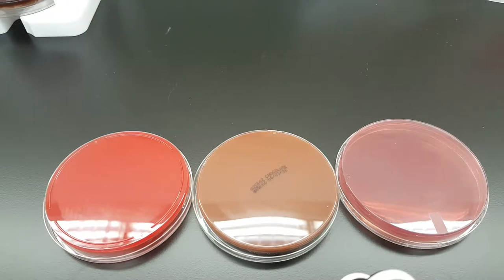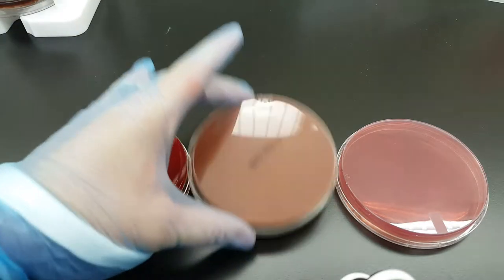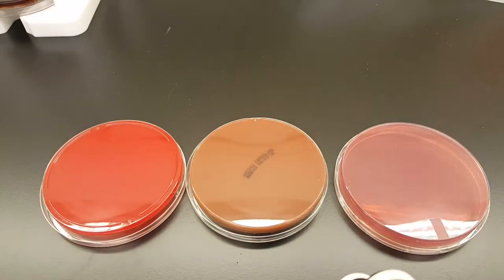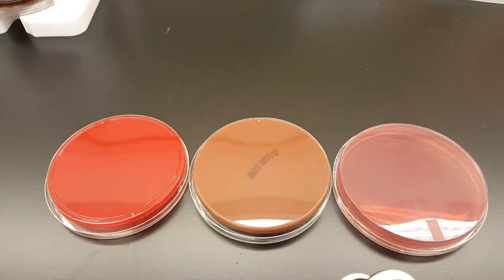Hey everyone, today we're going to talk about labeling and inoculating microbiology plates. This is a blood agar plate, this is a chocolate agar plate, and this is a MacConkey agar plate. I have taken them out of the refrigerator — they have come to room temperature. I have wiped the condensation off of the bottoms so that my marker can be clearly seen and doesn't wash away.